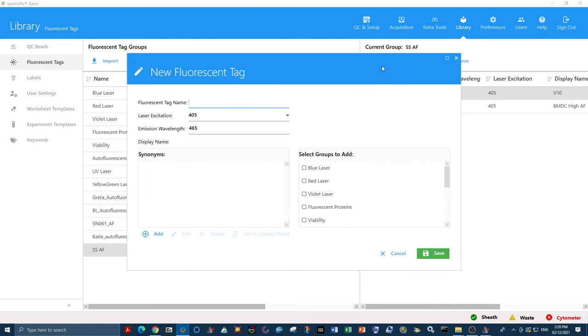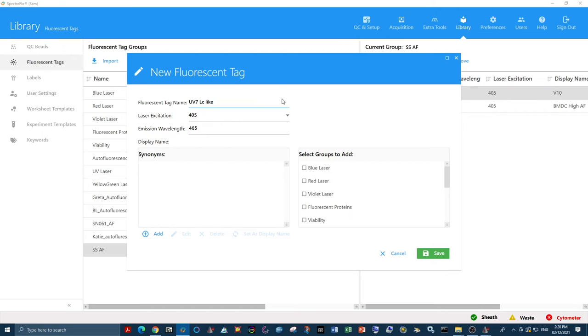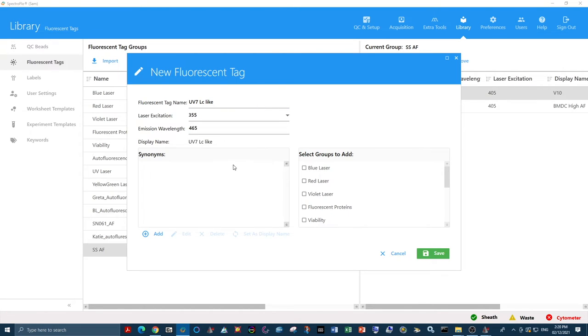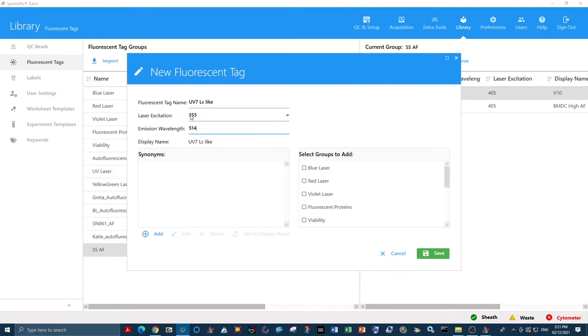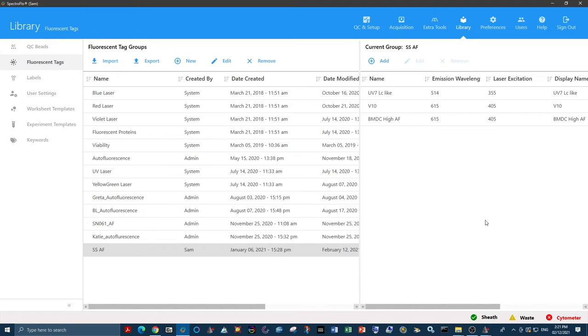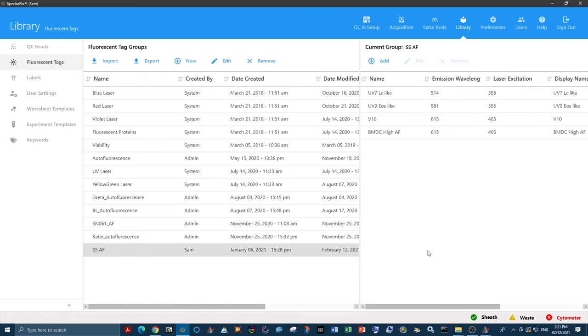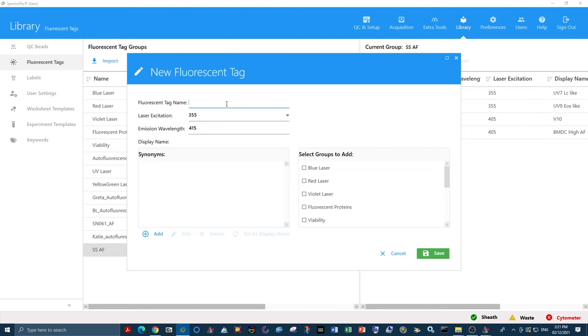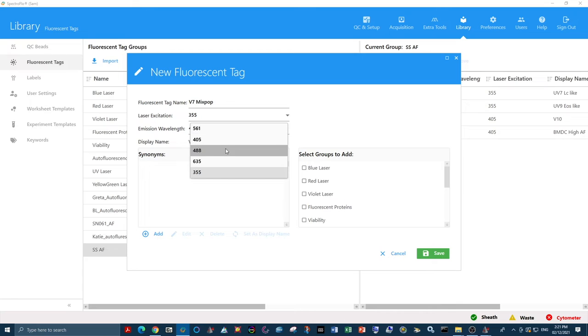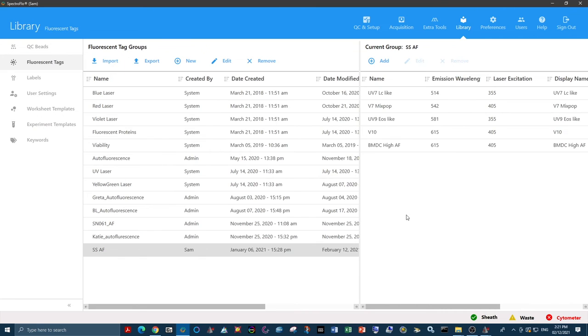So I have my group of autofluorescent tags here, and I'm going to add the three that I have just distinguished. I will designate them here in the software. First, I have my UV-7 high lymphocyte-like population. This is coming off the UV laser. We just need to know what the max emission wavelength is of that detector. Now we add the other two. I have a UV-9 eosinophil-like population and a V-7 mixpop population coming off the violet laser, peaking at 542.